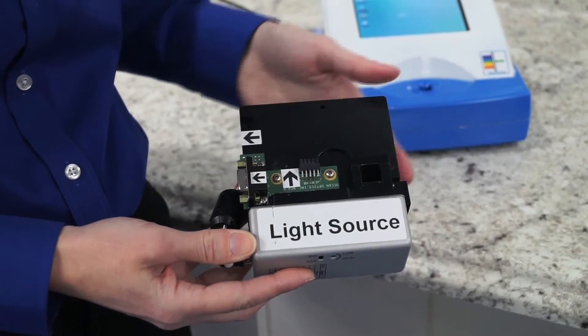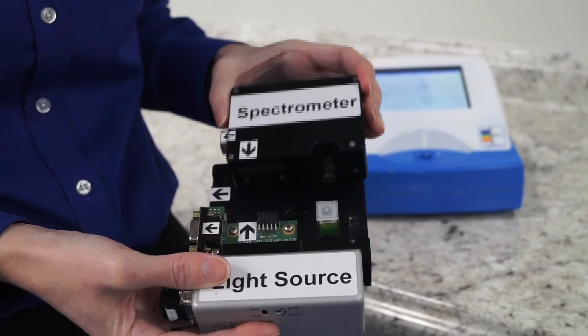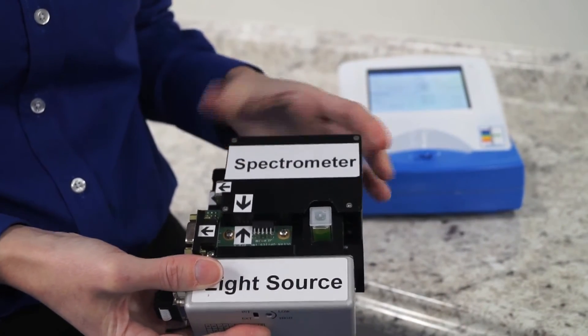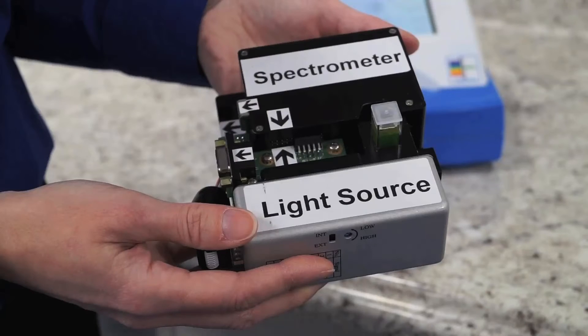For example, we might use direct coupling of light through the cuvette to the spectrometer. This makes the subassembly more robust and improves light throughput.